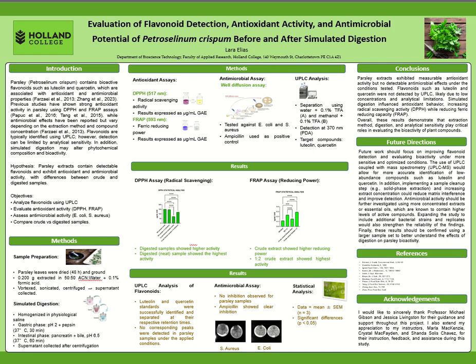Flavonoids were analyzed using UPLC at 370 nanometers. Antioxidant activity was measured using DPPH, which evaluates radical scavenging, and FRAP, which measures reducing power.